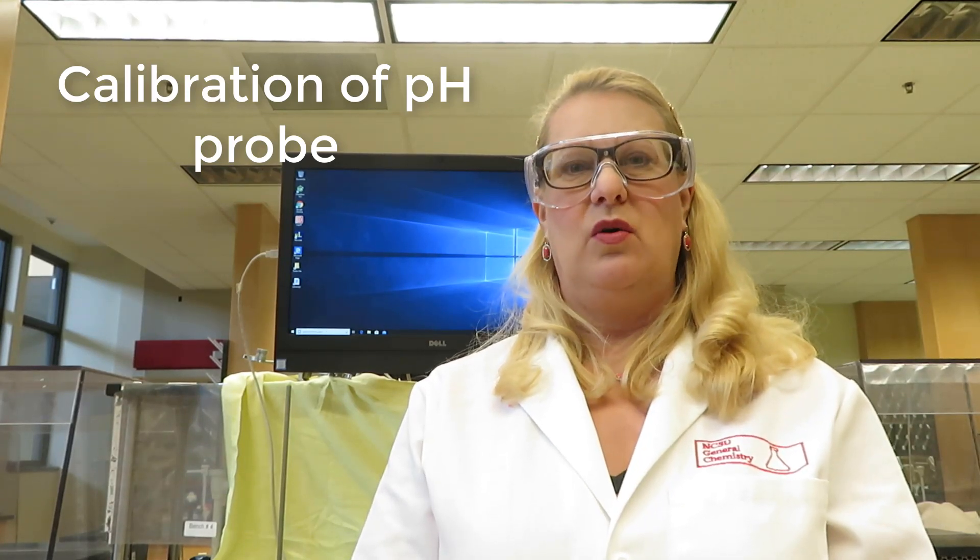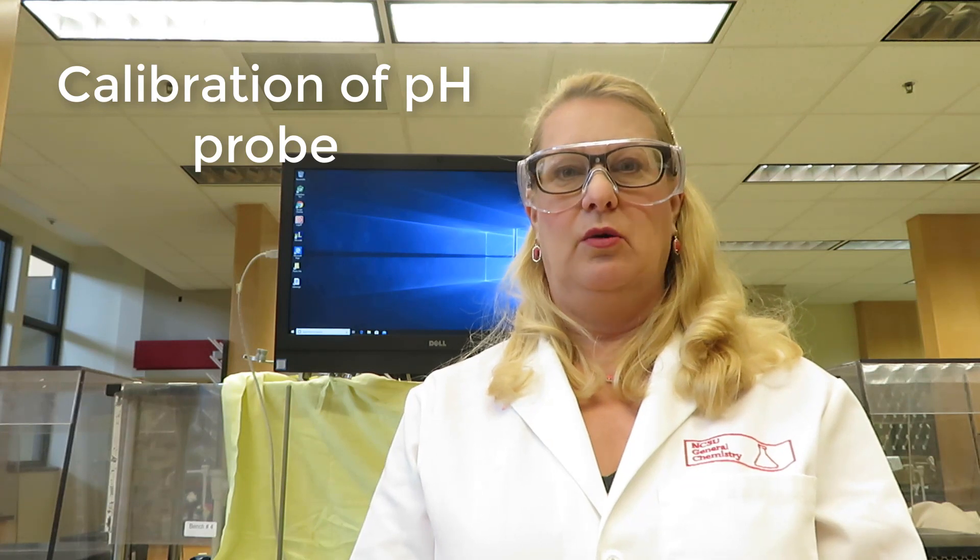Hello. Today we're going to calibrate a pH probe for various experiments, titration, or measuring the pH of solutions or buffers.